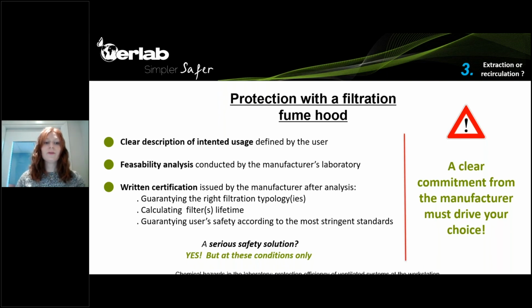Then a feasibility analysis conducted by the manufacturer's laboratory, analyzing if it is actually possible to use a filtration fume hood. Is it adapted for the laboratory handling?